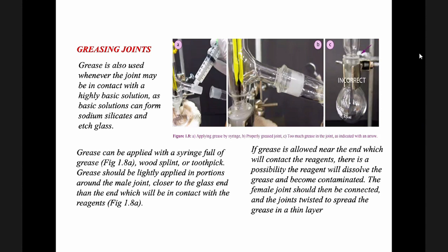But be careful not to apply too much grease, because it might dissolve and your solution can become contaminated.